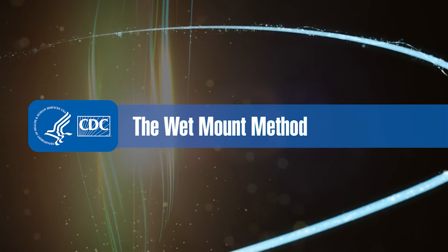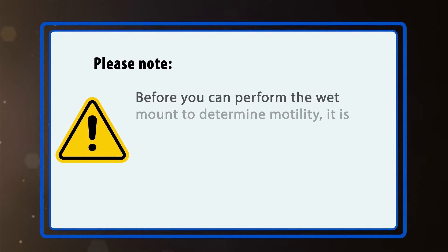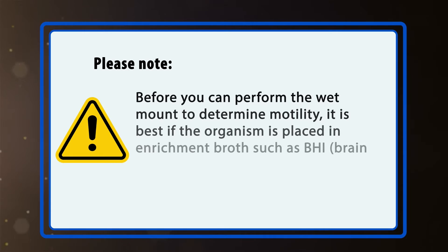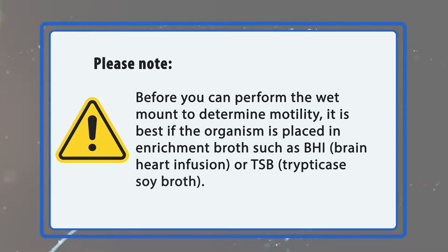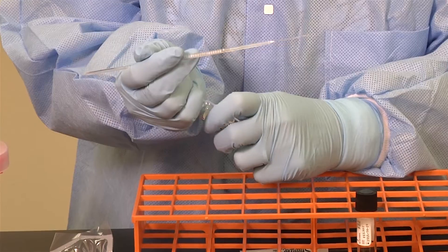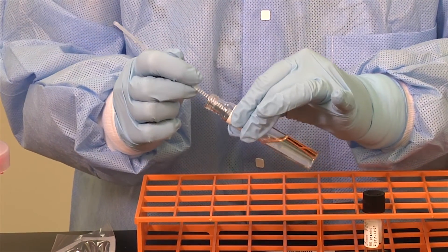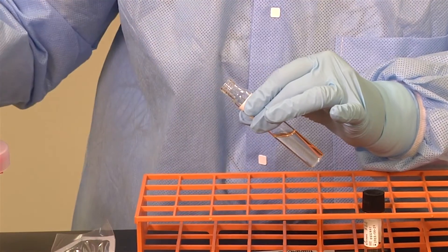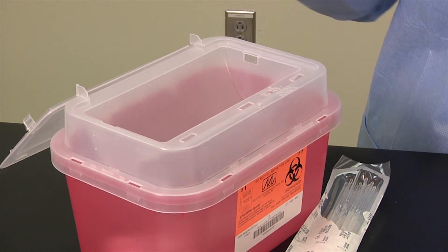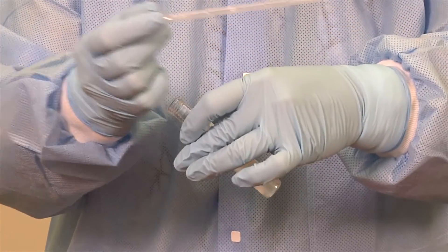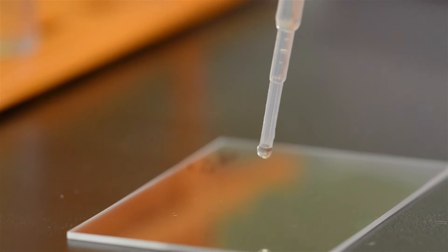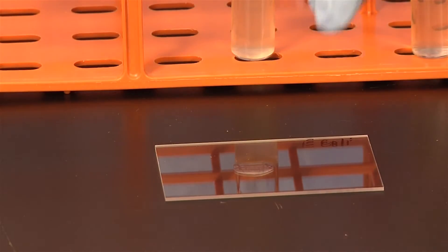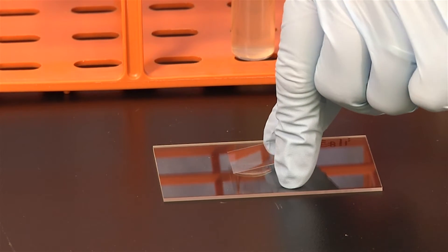Wet mount procedure. Before you perform the wet mount to determine motility, it is best if the organism is placed in an enrichment broth such as BHI (brain heart infusion) or TSB (trypticase soy broth). Using a plastic loop, isolated colonies are picked from a blood agar plate and transferred to a labeled tube of BHI broth. The loop is then discarded into the sharps container. Using a sterile Pasteur pipette, remove a small amount of broth and place a single drop on the center of a large glass slide. Place a glass cover slip over the sample and allow the organisms to settle for a minute.